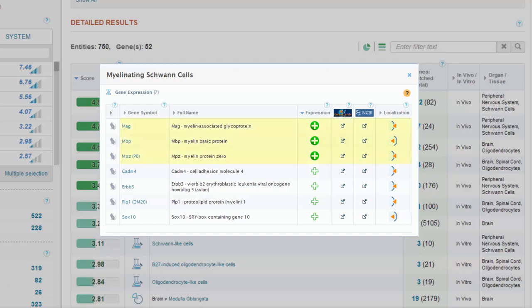such as MAG, MBP, and MPZ, and also by the expression of SOX10, which is a known neural crest stem cell marker that is enriched in melanocyte, oligodendrocyte, and Schwann cells.